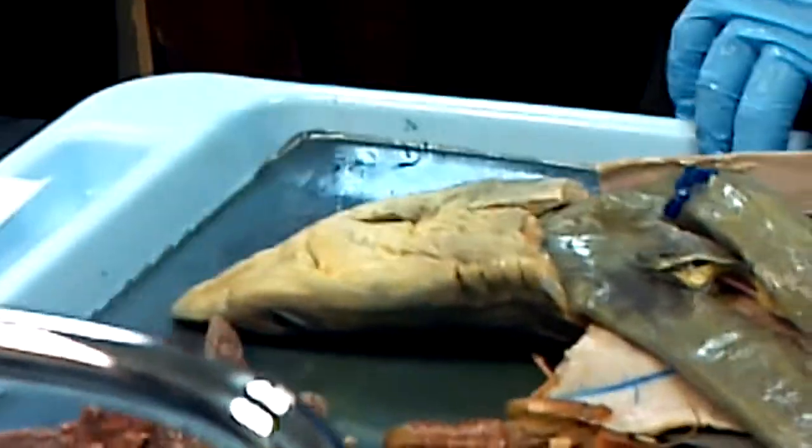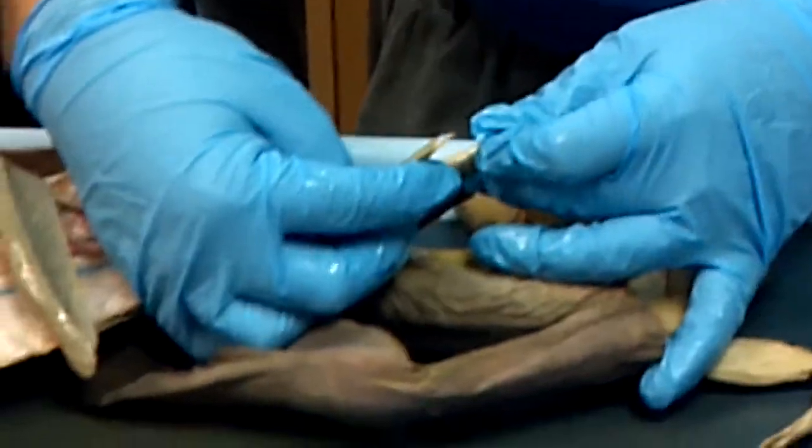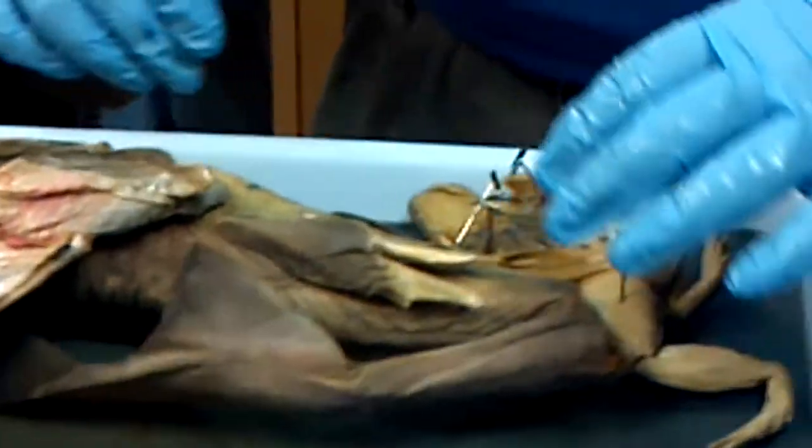There are external structures too. Gills, mouth, parts of the head, nares, pectoral fins, dorsal fins on the back, anal fins, claspers, cloaca.